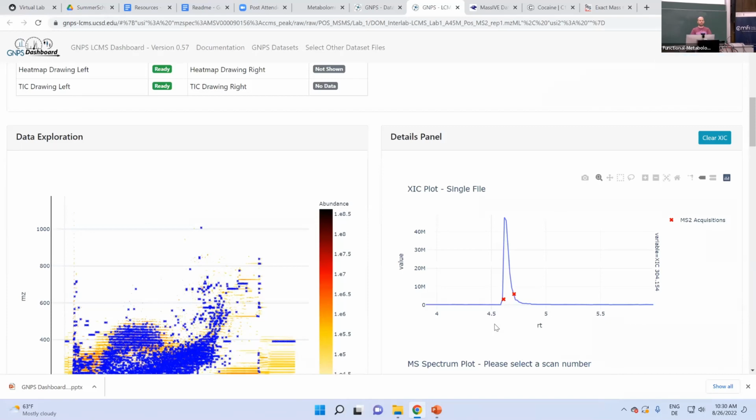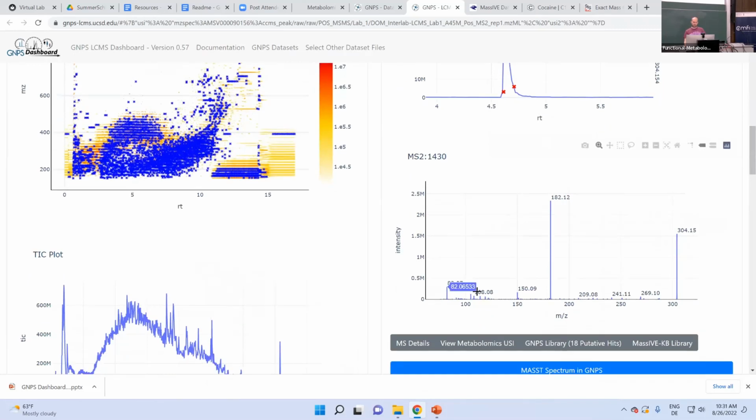Now from the MS placement side, it's not perfect, it's not at the apex, but in a complex sample with thousands of compounds, we can't be too picky about everything being placed at the top. But now I would say, okay, there is a molecule that has this mass within 10 ppm tolerance. We have a nice defined peak. We have 2 MS. So eventually what I'm gonna do now is click here on this marker to inspect the MS, and maybe because I've seen that spectrum, I would say, okay, I believe that this is something.